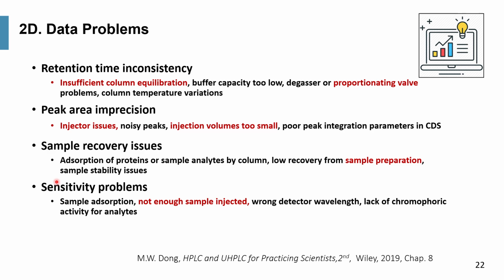Occasionally, particularly with low solubility drug substance or drug products with the API, there could be sample recovery issues from sample preparation, such as insufficient or incomplete extraction. Sensitivity problems could be due to sample adsorption, not enough sample being injected, or other things such as the wrong detector wavelength and other situations.